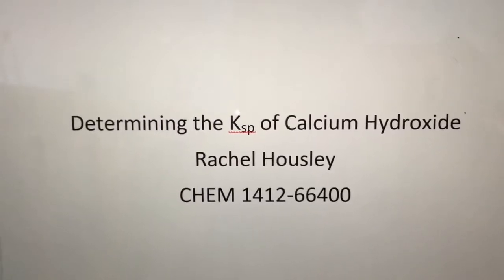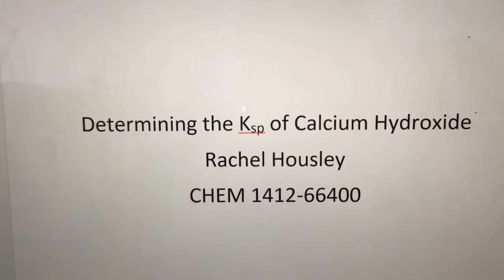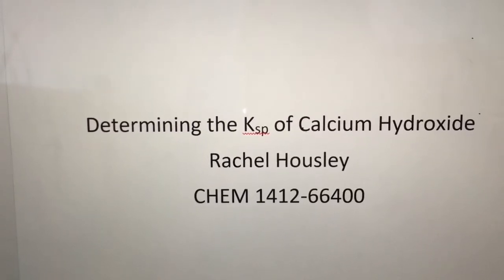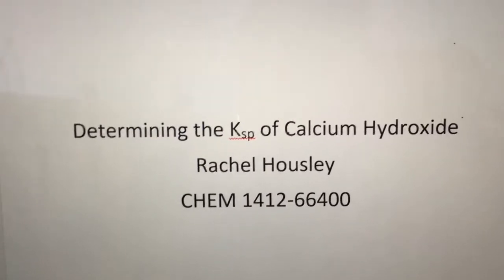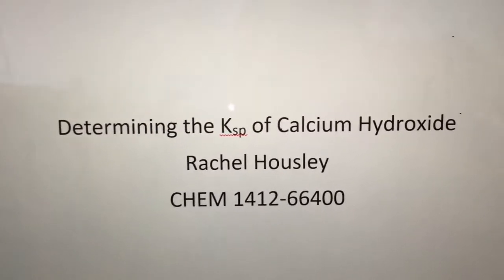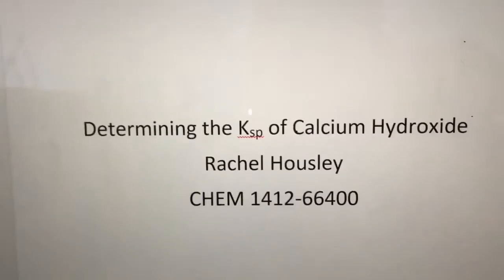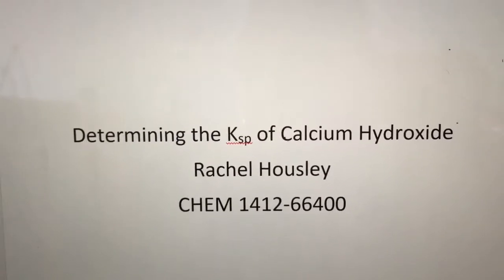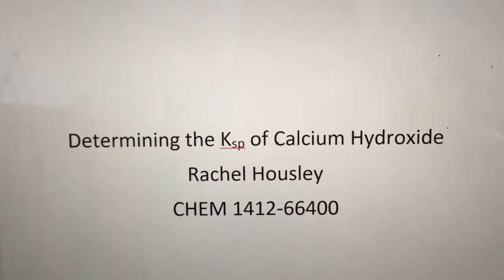For the second part, I will be seeing the differences between the molar solubility of calcium hydroxide when it is by itself with hydrochloric acid, and then the next part will be when it is combined with calcium chloride, and I'll be performing a second titration for that.